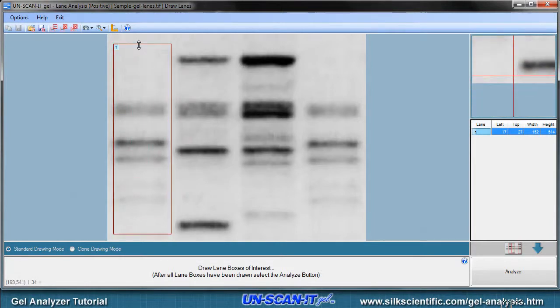You should generally draw the box starting above the first band and extending below the bottom band, and wide enough to include the entire band.